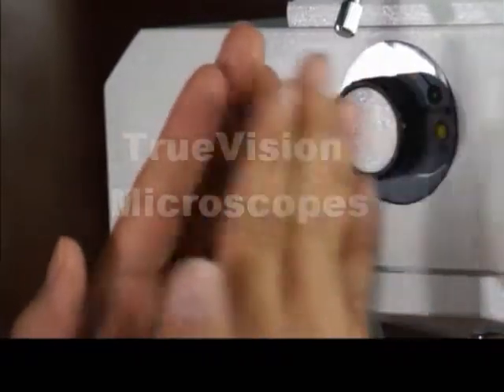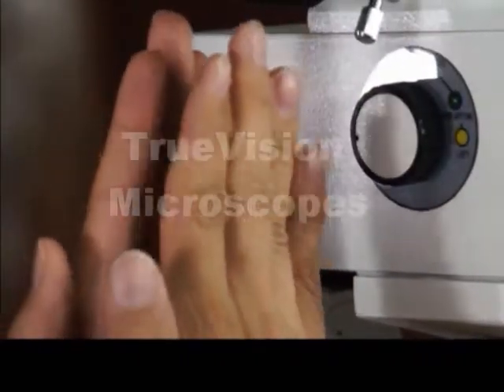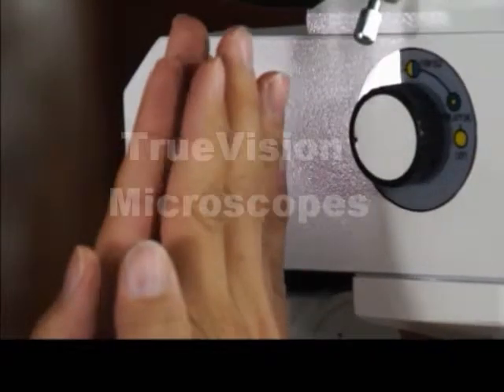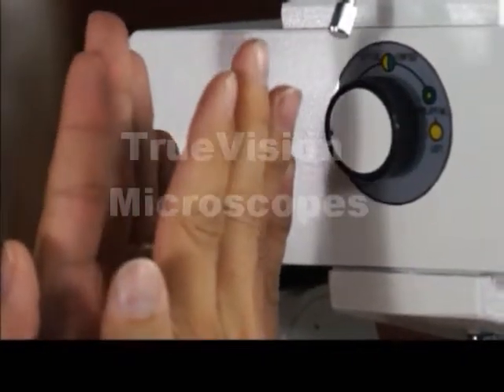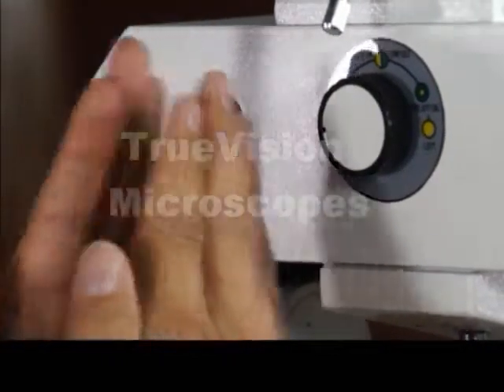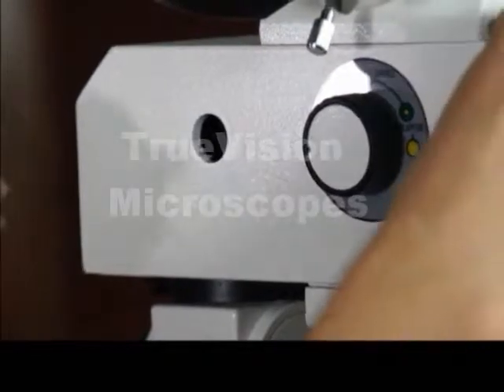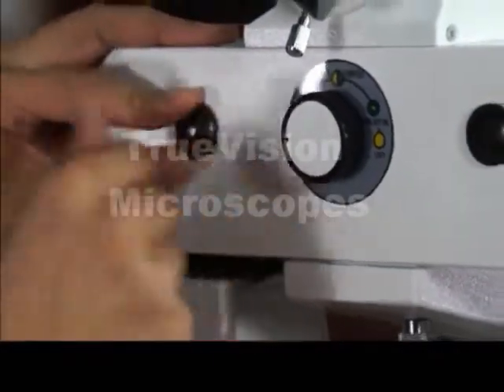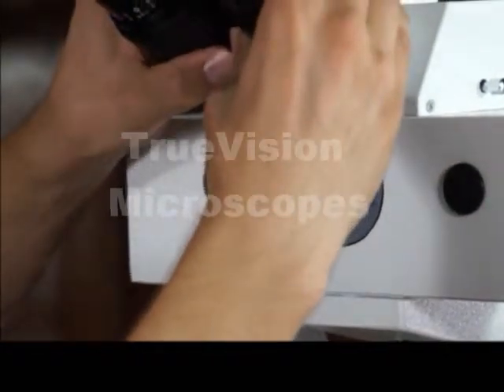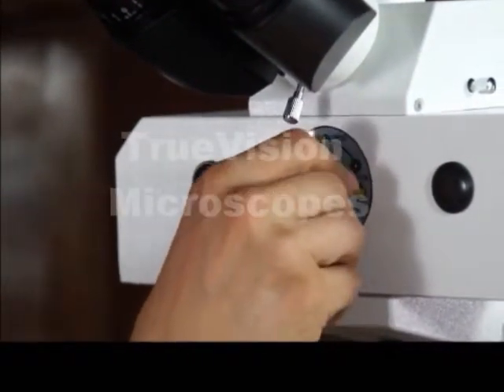The other screw adjusts the angle of the separation line. Sometimes the separation line is fatter on one side, and one of the screws adjusts that. You simply slightly turn the screw while looking into your eyepieces and adjust your separation line as desired.